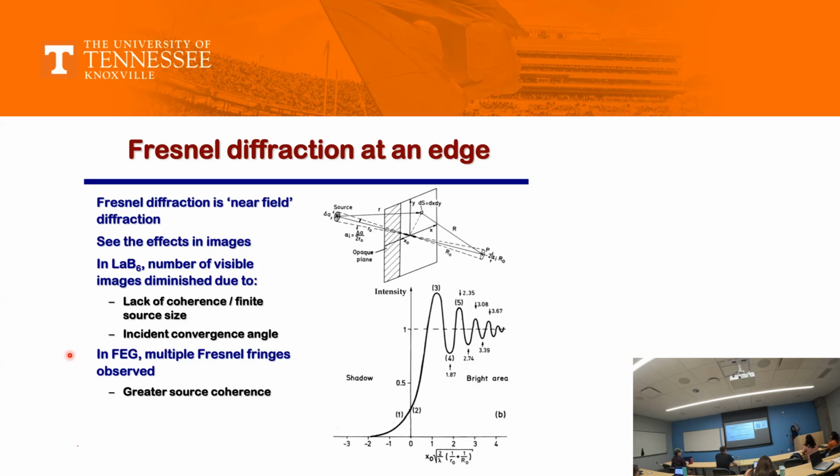analogous examples to provide. Now, if you're seeing the diffraction happening very close to the source, you call it Fresnel. And when it is very far, you can simply call it Fraunhofer. But then again, it is debatable. People will have different opinions. For example, here on the screen, it is claimed that if you have two different sources, LaB6 versus FEG, depending upon how coherent the source was, your type of diffraction and the final answer that you would get would change. So this is one thing.